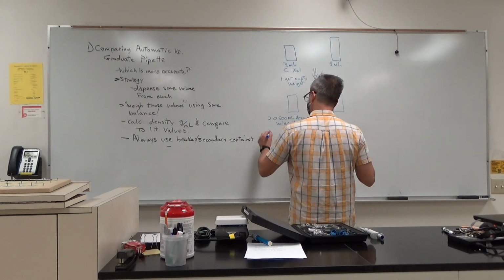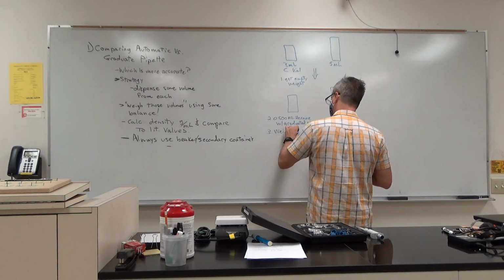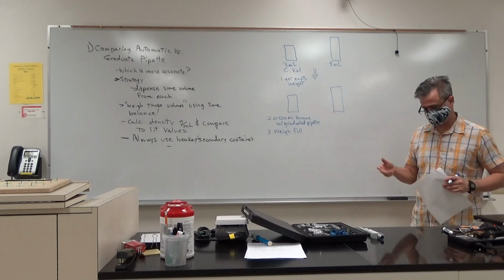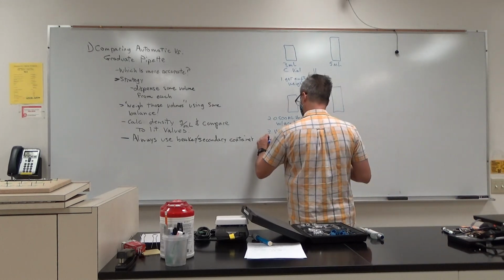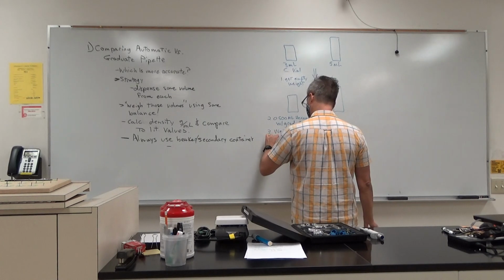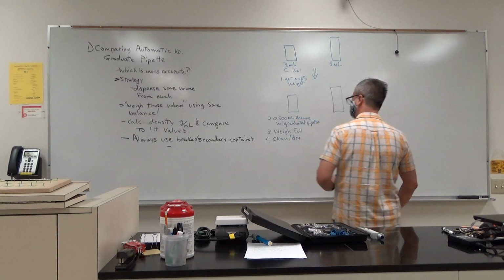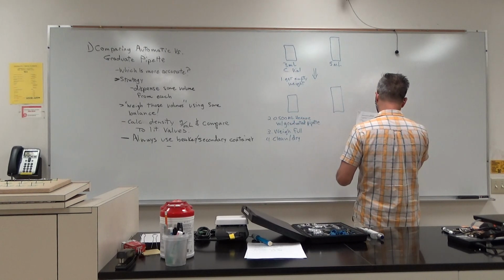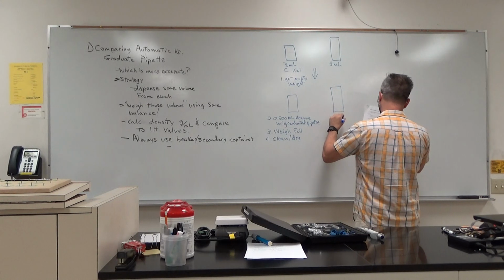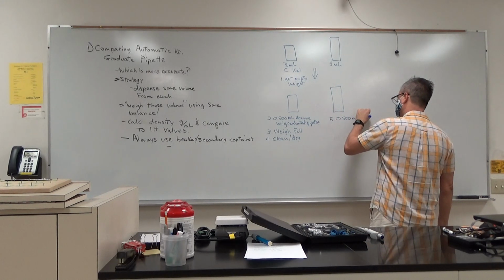Then weigh it full. Then clean and dry the pipette. And then over here, 0.500 ml with the auto pipette.